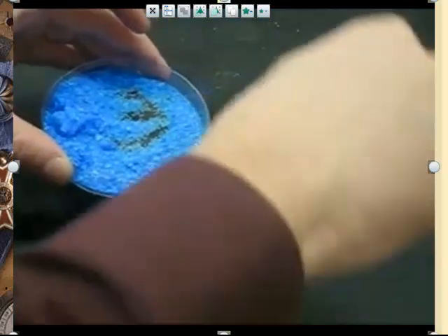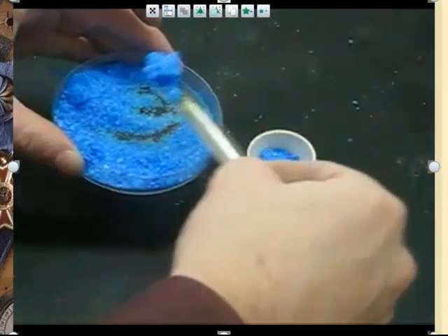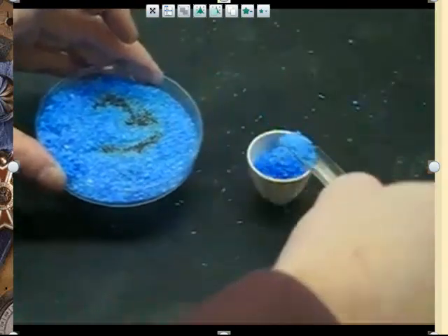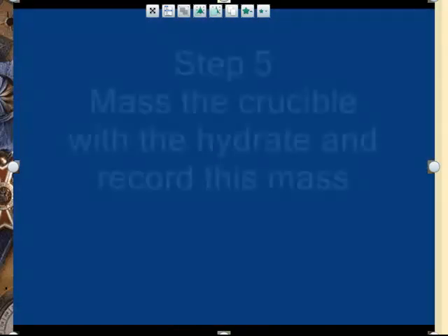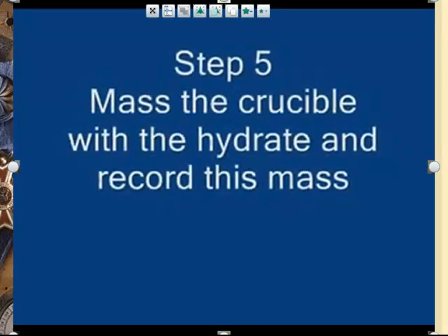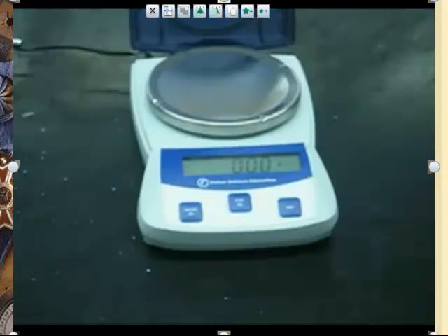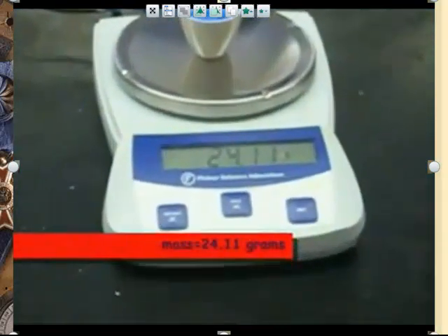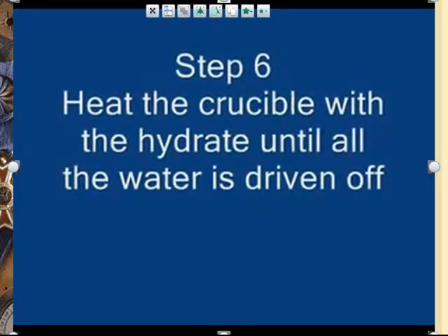Alright, so now we're going to go get some CUSO4 hydrated. It's blue, pretty cool looking crystals. We're dumping those into the crucible. This is a skill we've learned in lab all year. And now we have the mass of the crucible with the hydrate. So we can't just pour the solid on the balance, so it's sort of our container. We get 24.11 grams, so that's the crucible plus the hydrate.